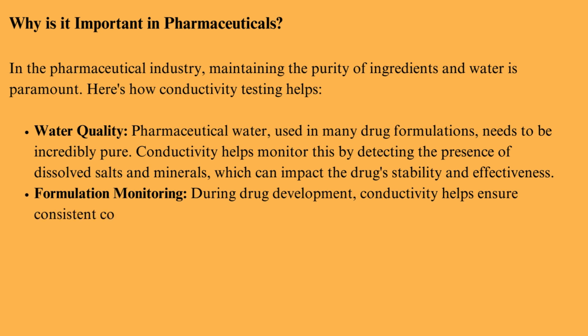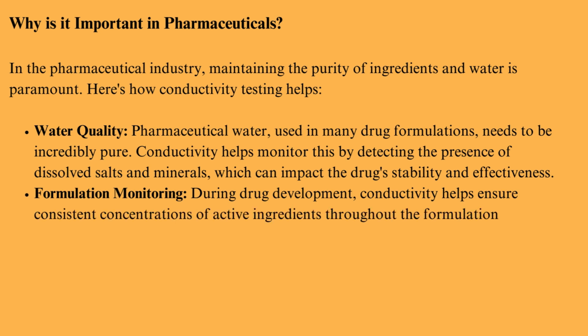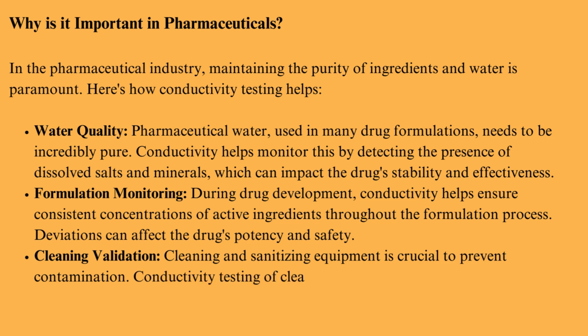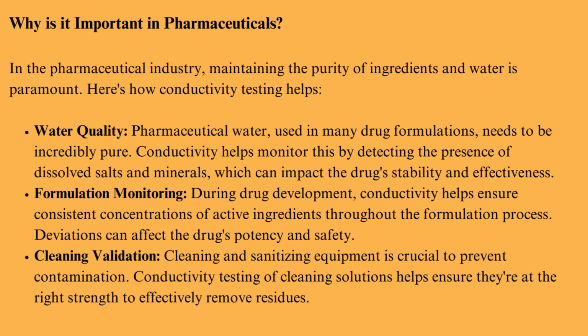Formulation monitoring, during drug development. Conductivity helps ensure consistent concentrations of active ingredients throughout the formulation process. Deviations can affect the drug's potency and safety. Cleaning validation. Cleaning and sanitizing equipment is crucial to prevent contamination. Conductivity testing of cleaning solutions helps ensure they're at the right strength to effectively remove residues.